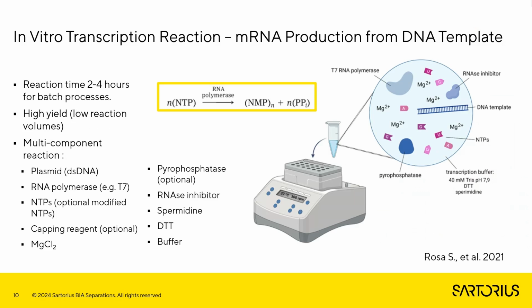We don't absolutely have to provide, but it's beneficial to the reaction if we provide pyrophosphatase, because pyrophosphate, which is this side product of the reaction, is actually very poorly soluble, so it can lead to a lot of precipitation. And still, I think oftentimes we see reactions that are reported as precipitated, and it's probably because of pyrophosphate that's being formed during the reaction, not actually due to mRNA itself. mRNA turns out to be actually quite soluble, even to a very high concentration.